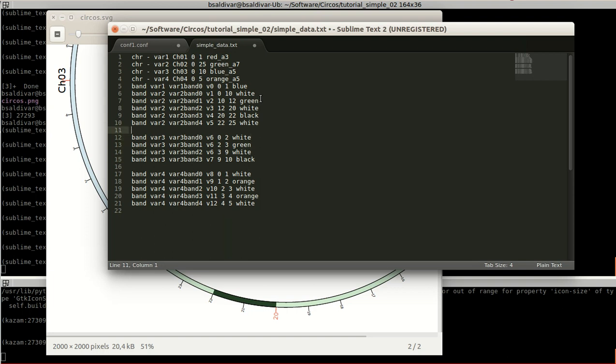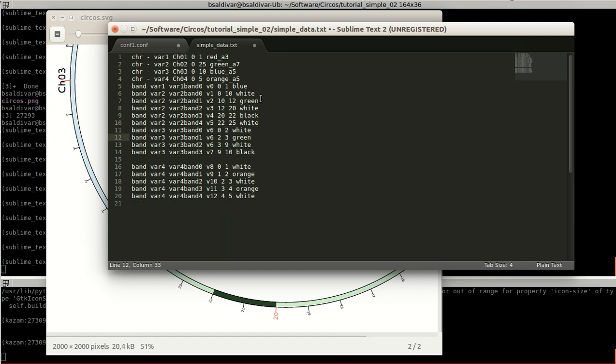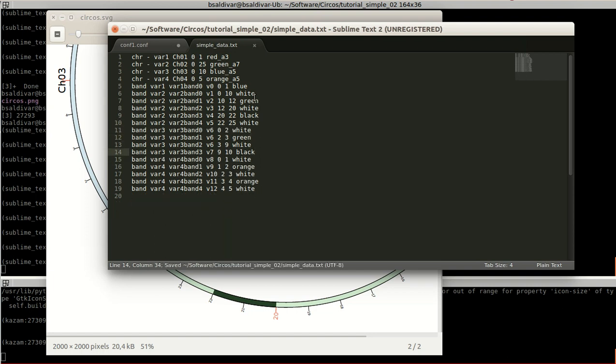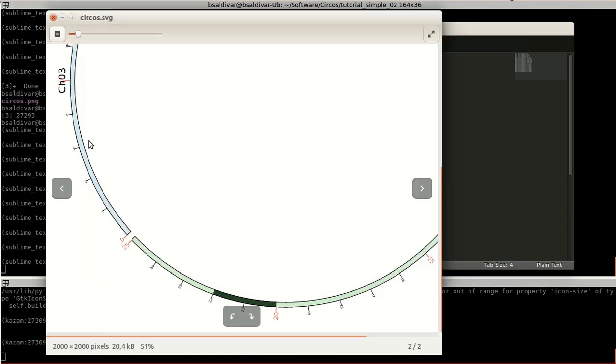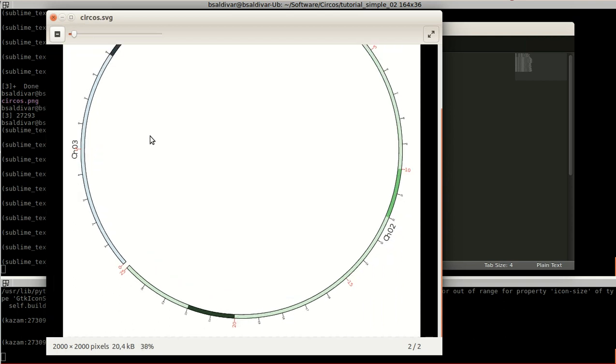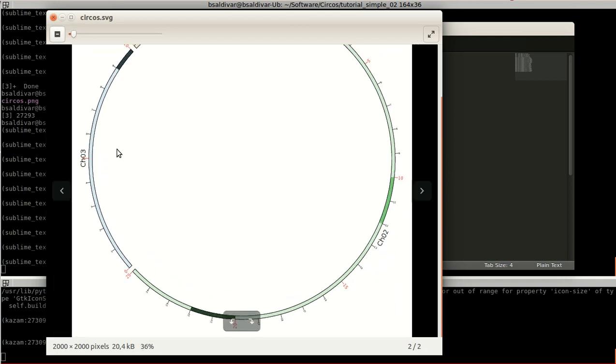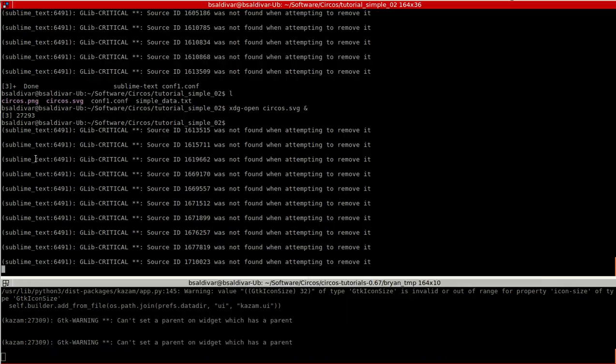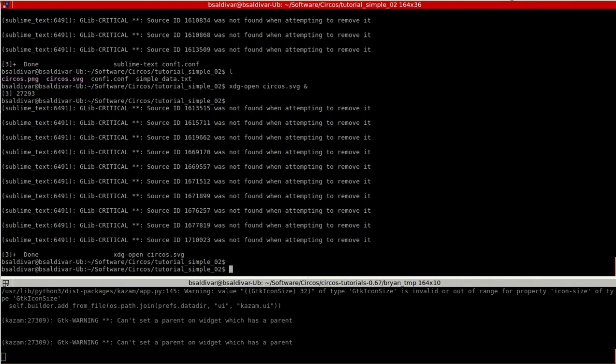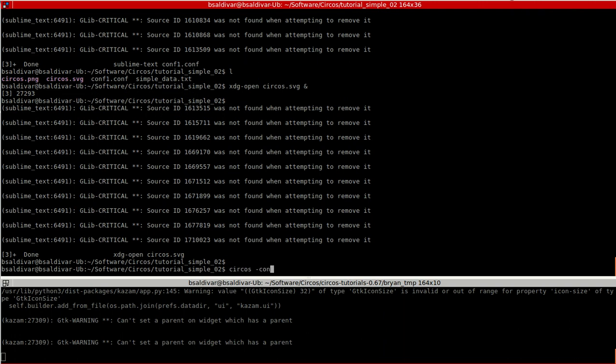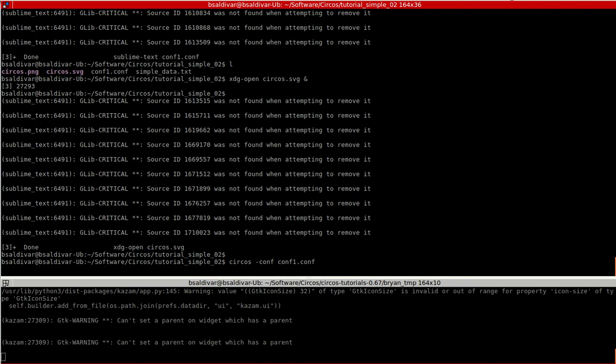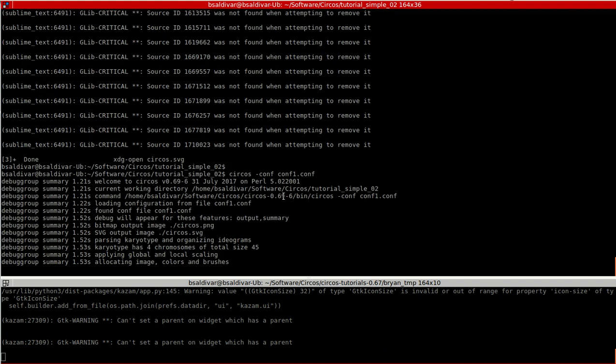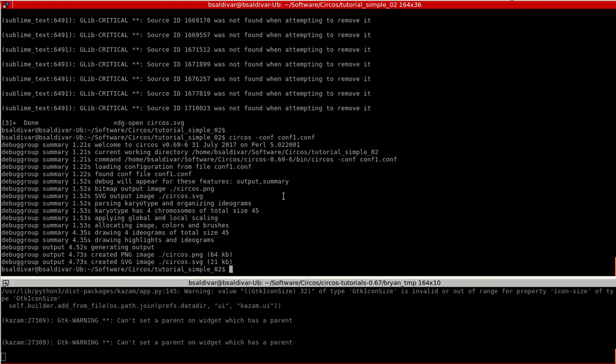So that's it. Let's go to see what happens now. Another time to look at this. Remember that in karyotype 3 we only have one band. So circles, all, close this, all.